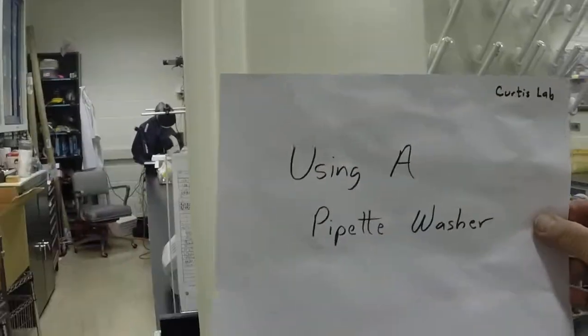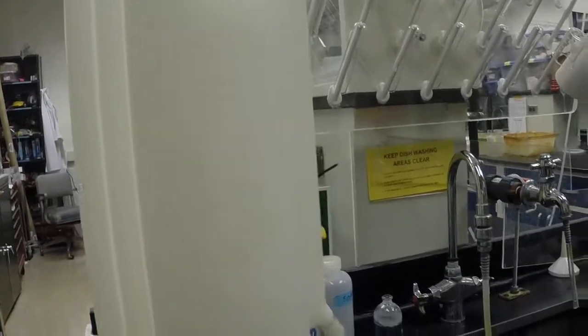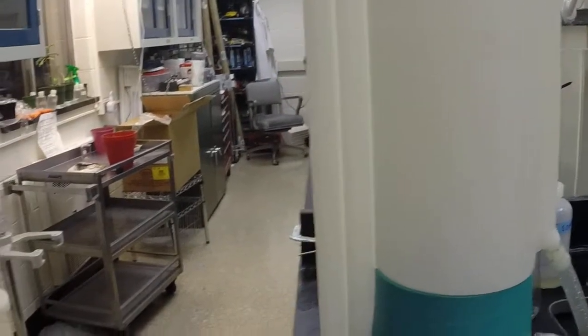I'm going to go through a quick use of a pipette washer which is the device you see in front here, but before we actually put the pipettes in there I'm going to remind you that they have to be washed first.